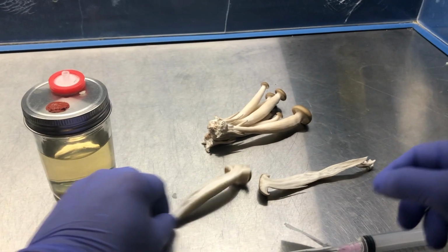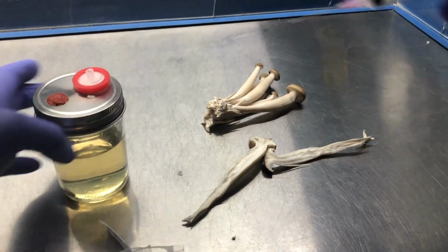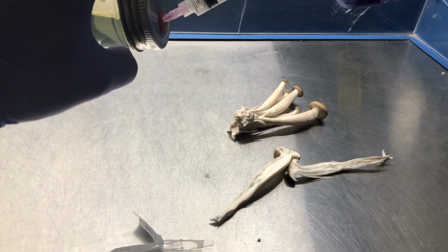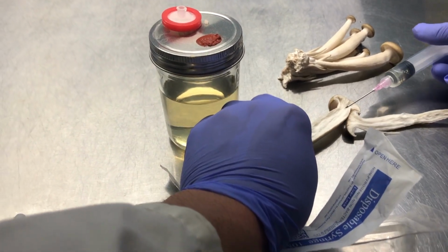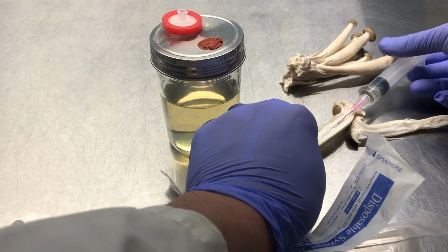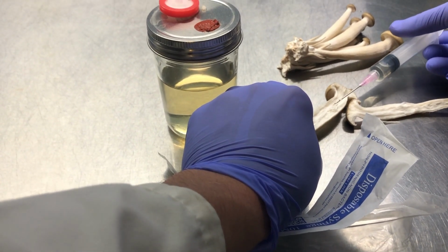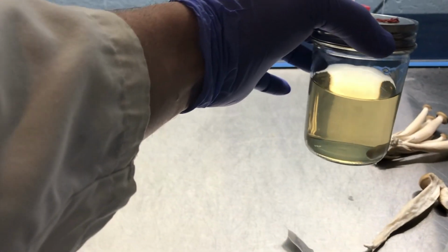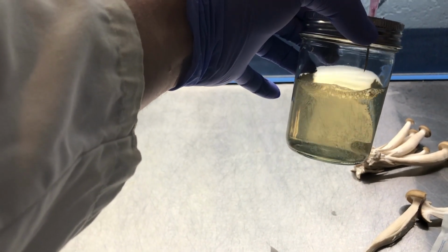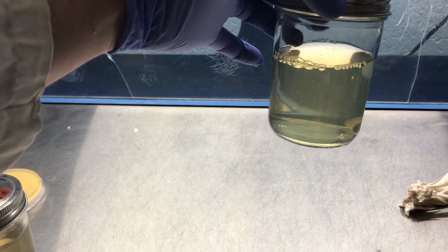Looks like that's a really good spot, and with this you only have one shot. So I'm gonna try to start by priming the pump. So I've got a little bit of liquid for some force, and then you're just gonna want to slide your needle in, gather up some tissue inside that needle, and then we're gonna take it, and you can see that piece floating around in solution right there. That's the sterile tissue from the needle biopsy.